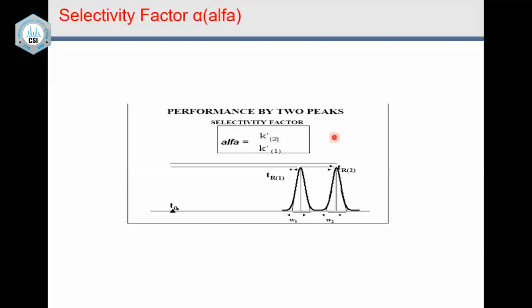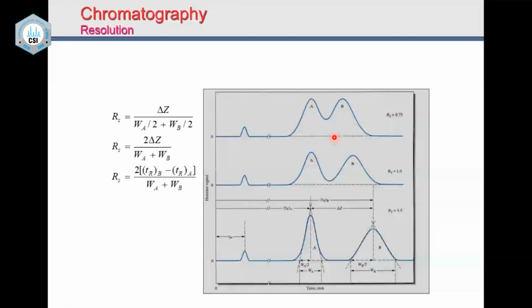There is one more factor which talks about resolution. Resolution is very critical because we need to have a separation. We don't want a separation like this. We don't want a separation like this. We want a separation where there is baseline resolution.